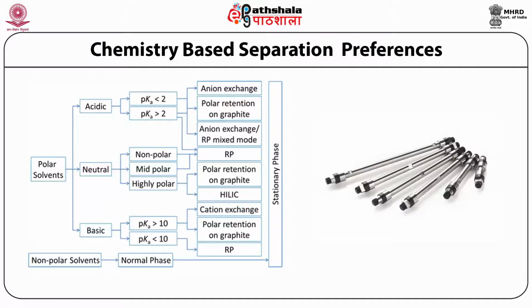So non-polar solvents are used for normal phases only, whereas polar solvents are used for acidic, neutral and basic molecules by using different pH ranges and different types of columns. There is enough preference to work with polar solvents.